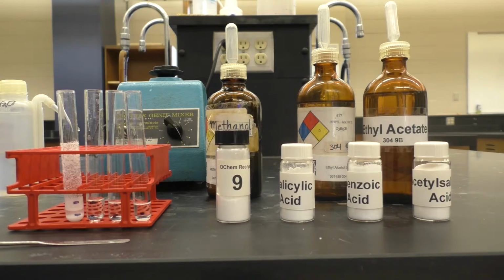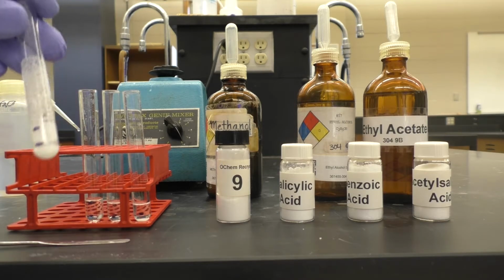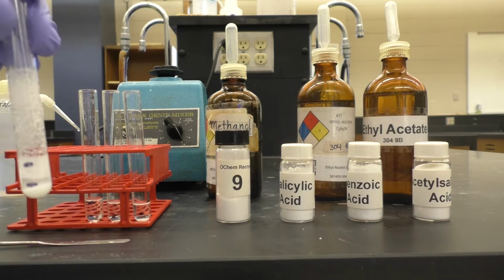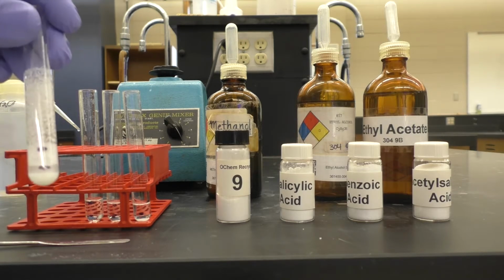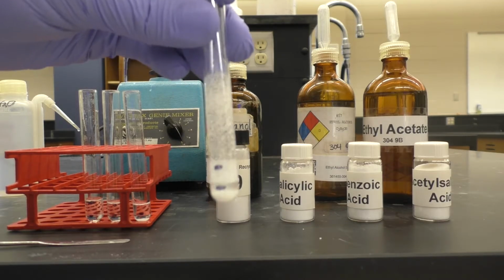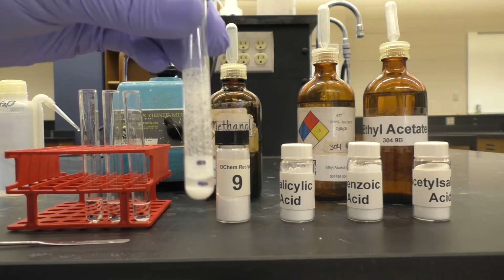We would heat a sand bath on a hot plate and test the solubility of those compounds at the elevated temperature in the two solvents and try to find the one where all of the material will dissolve at the elevated temperature. Here, since we only have one solvent that leaves the compound entirely undissolved at room temperature, we're just going to go ahead and try the recrystallization from water and hope that we can get everything soluble at elevated temperature.